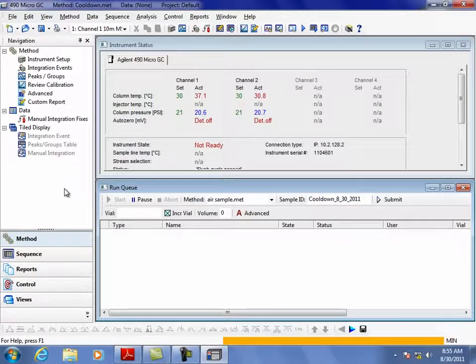In front of the methane, but I like to leave it cool enough so that we can see the methane before we see the CO. CO is kind of an odd little peak in that it has a little bit of a tail to it, and if it's in front of methane, sometimes we can't get a good separation. Now, after that, we're going to back flush it.